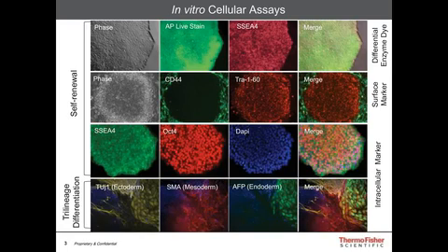This slide summarizes the traditional method of checking pluripotency and lineage-specific differentiation of stem cells using differential enzyme dye, surface markers, and intracellular marker staining using a host of antibody dye conjugates. For example, self-renewal marker expression is confirmed by alkaline phosphatase live stain or other markers like SSEA4 and TRA-1-60 or OCT4 in undifferentiated cells. CD44 serves as a negative cell surface marker.